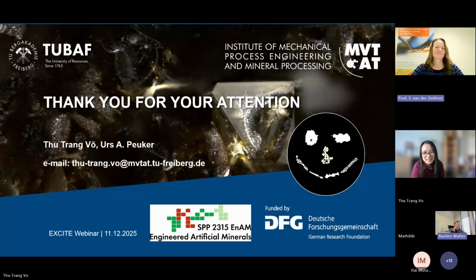Hello. Thank you very much for the presentation. You talk a lot about particles and especially watershed segmentation of particles, but I was wondering, because you presented different softwares and tools, do you have any recommendation if I would like to segment fractures and labelize fractures?